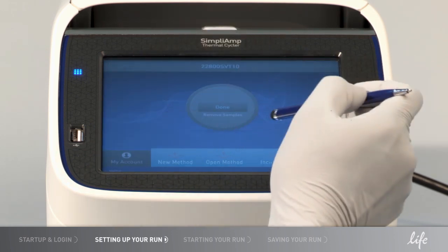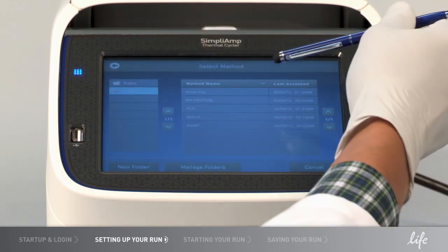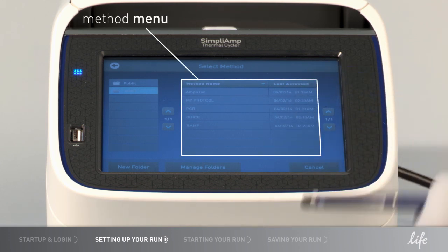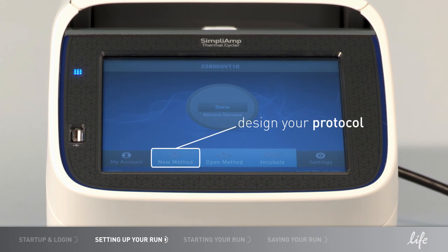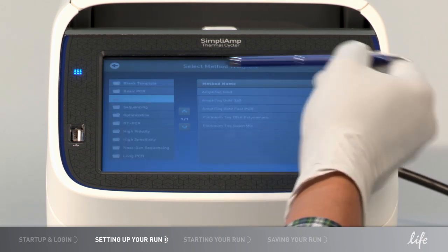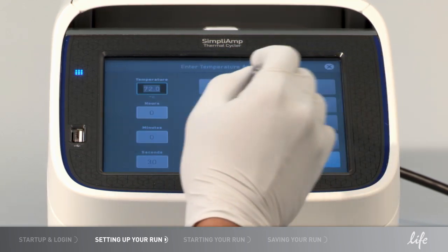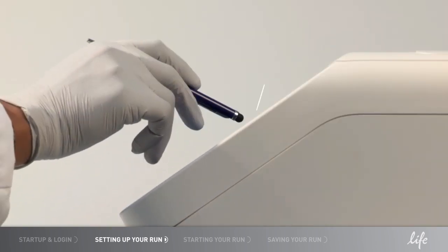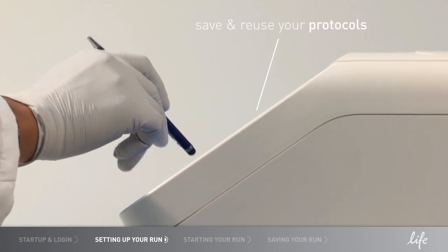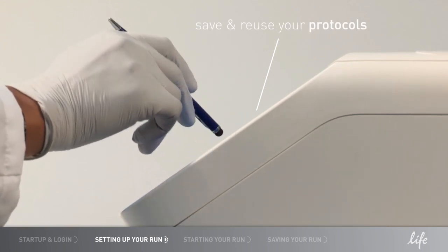Select a method by clicking Open Method to access your own personal folder or look at methods from other users. If you don't have method files yet, you can select New Method to design your own protocol or choose from a list of preloaded methods. Enter your cycling conditions, including temperatures and times, and enter a name for your protocol. If you would like, you can save the protocol in your personal folder for future use.